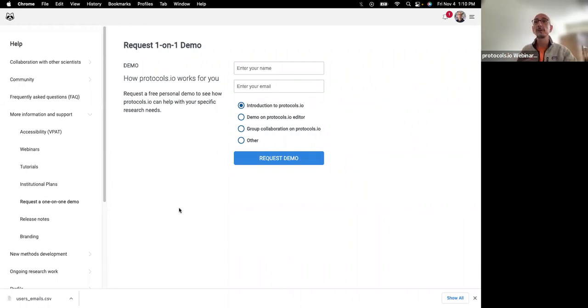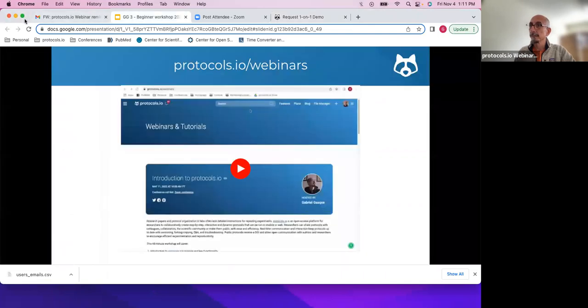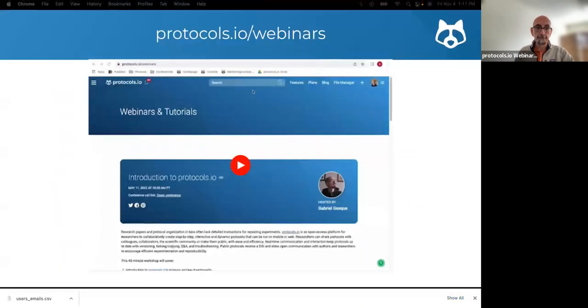And you can share your screen. Or us will be sharing our screen and teach you in a very dynamic way how to do what you want to do. So let me go back to the presentation now.